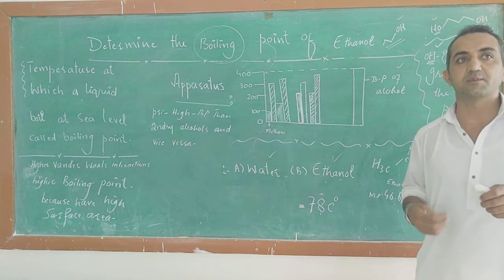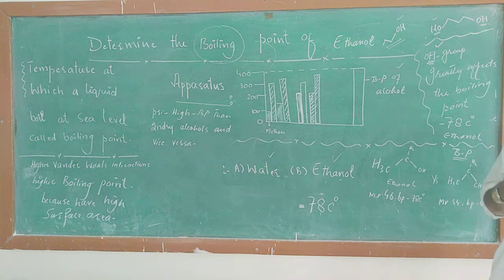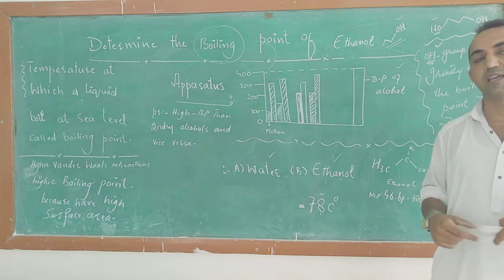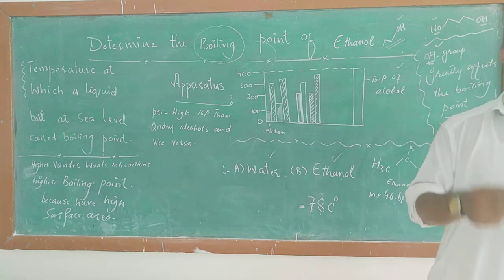When the temperature rises enough, we will stir it a little bit so that the temperature can distribute evenly inside the beaker and provide that even temperature to the ethanol.